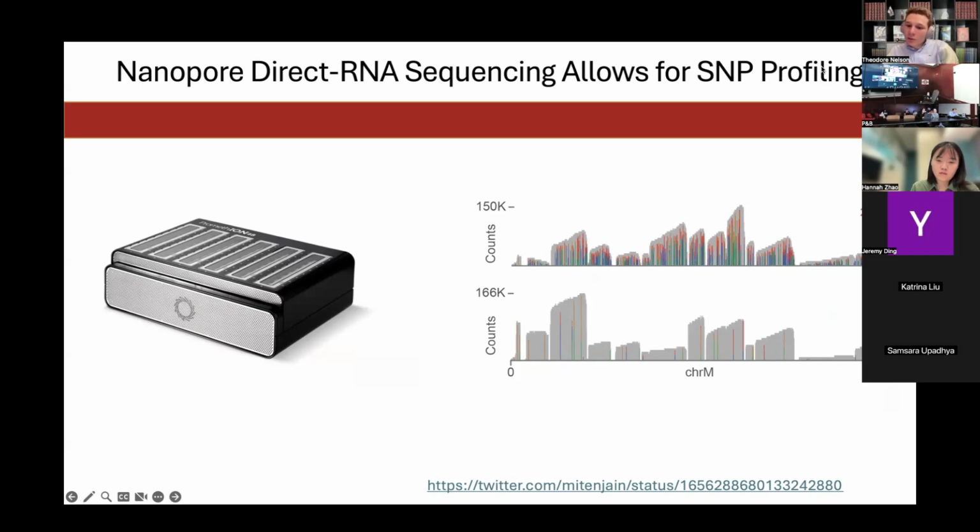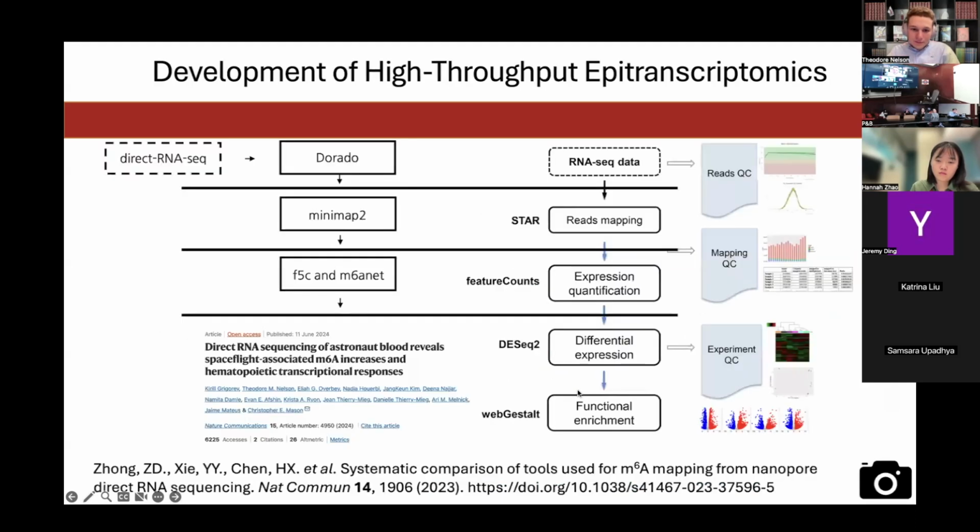And then ultimately, what we want to do is try and relate some of the SNP calling and genomic information to changes in the epitranscriptome and the like. So high throughput epitranscriptomics relates to this concept, beyond SNPs, beyond the four canonical nucleotides, of being able to include and call in high throughput fashion epitranscriptomic modifications. The question is, how many controls do we really need for a single experiment to generate data that we can analyze and compare and understand?